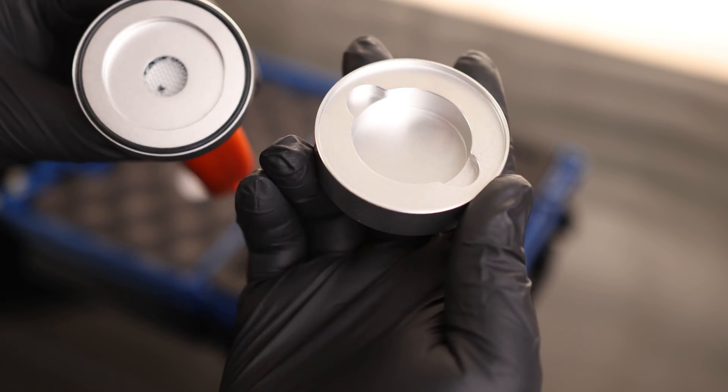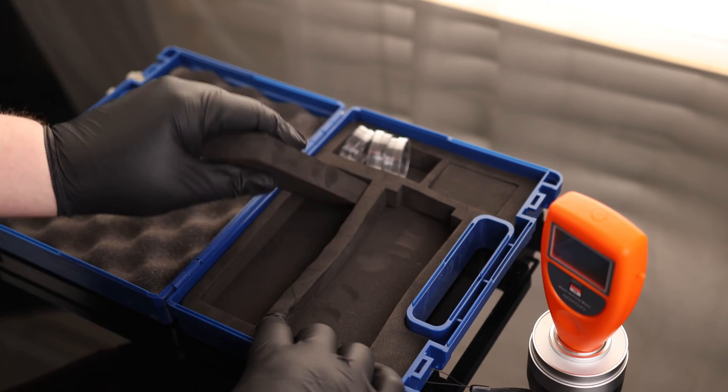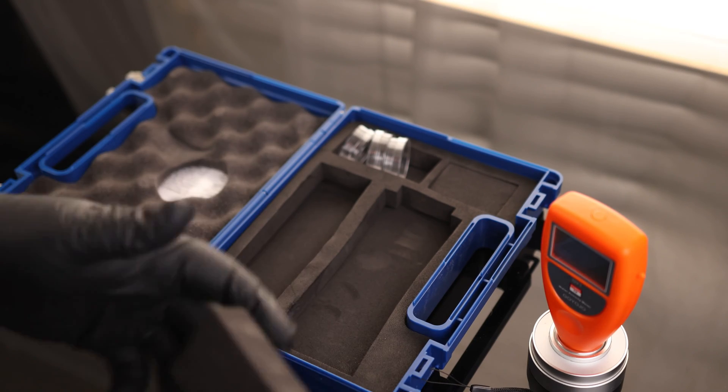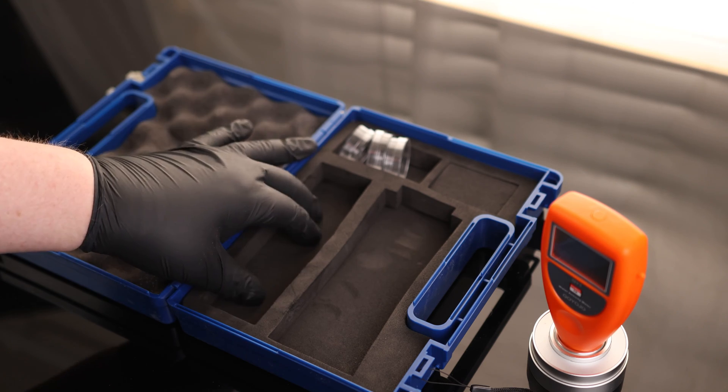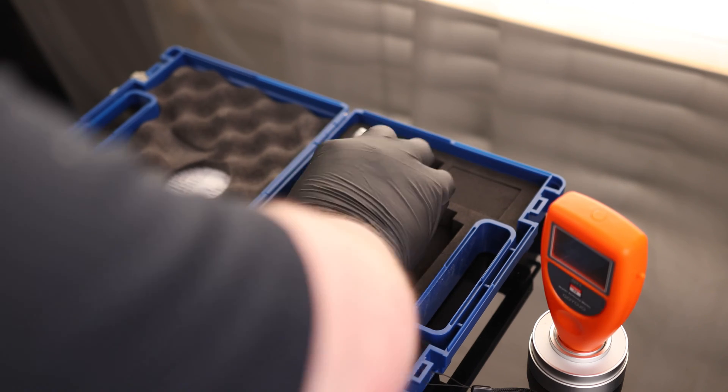We've got our sensor element in the center and this holder is just for holding our product. There's nice stiff foam on here. Looks like there's nothing beneath these, so these are just open spots — if we want to put something in here, like a container full of calibration fluid, we could get a spot there just for that. We also have a tether, so if you want to make sure you're not going to drop this thing, you can tether it up.